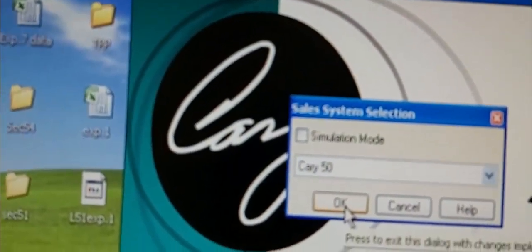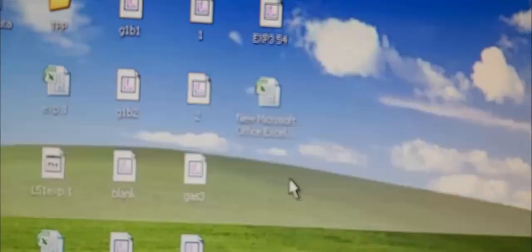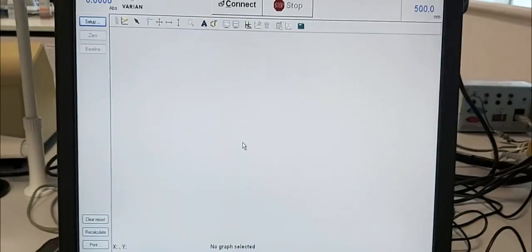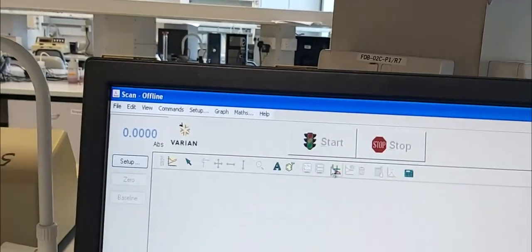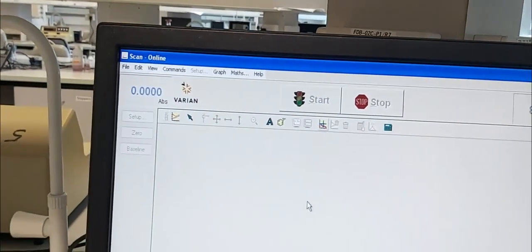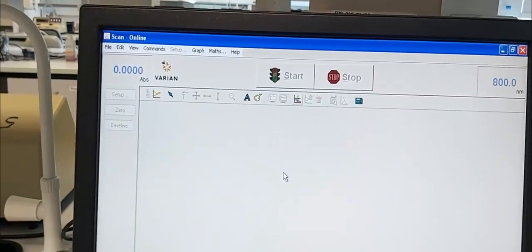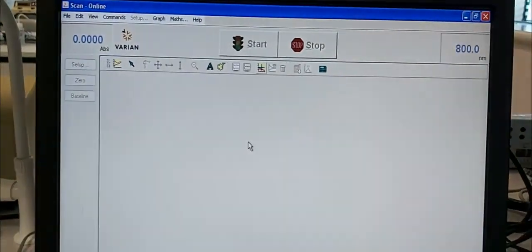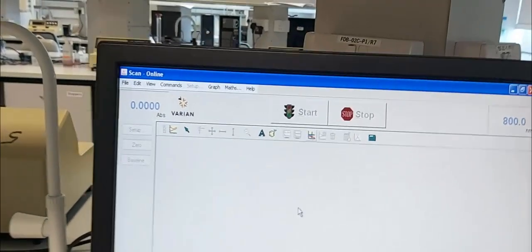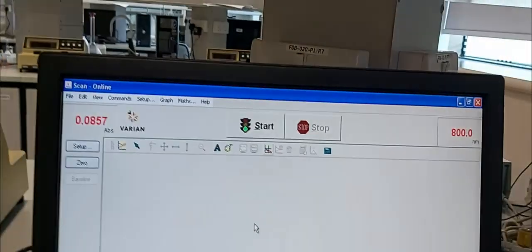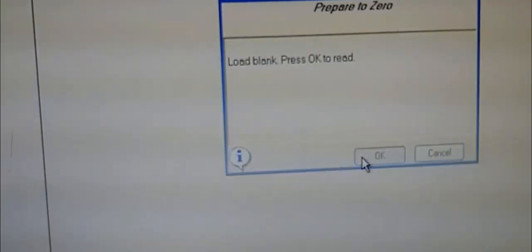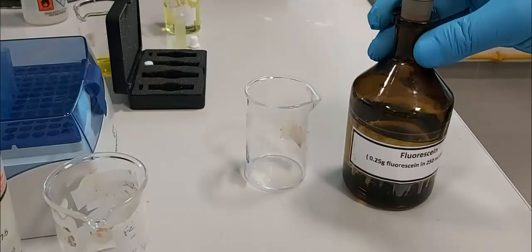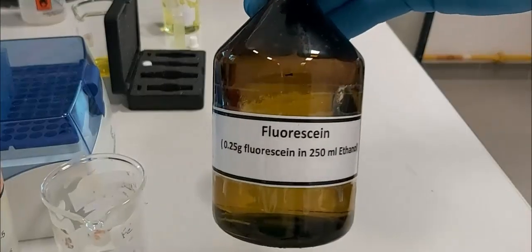We select Cary 50 because that is the equipment. The software opens, then we click on 'Connect' in order to connect the software with the equipment. In a few seconds it will be available — now it turns green. Then we click 'Zero', and it will ask us to introduce the sample. We already introduced the sample.